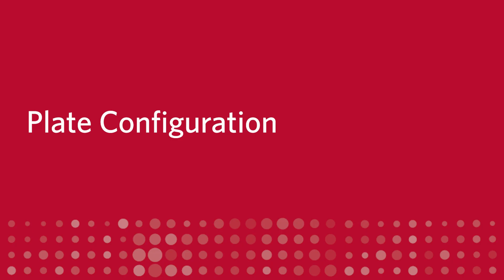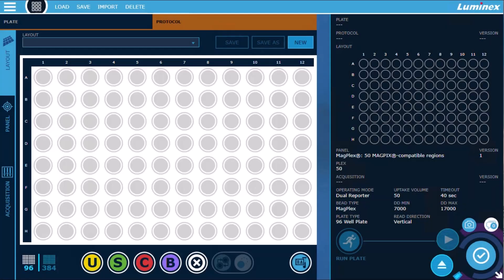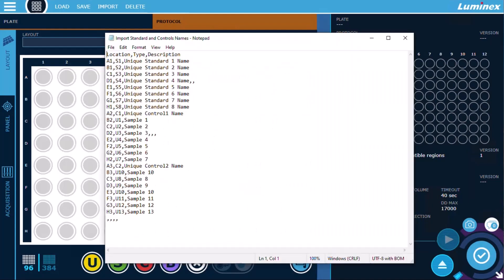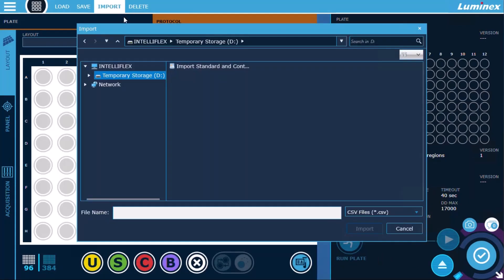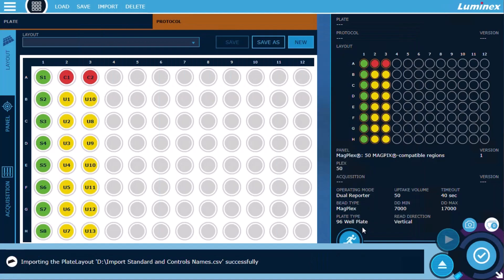Plate Configuration. Import. We've improved the import function for users who set up layouts and panels using CSVs. Extraneous commas in import files are now ignored, which reduces the likelihood of a failed import.